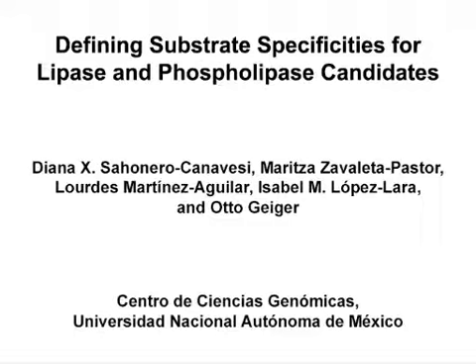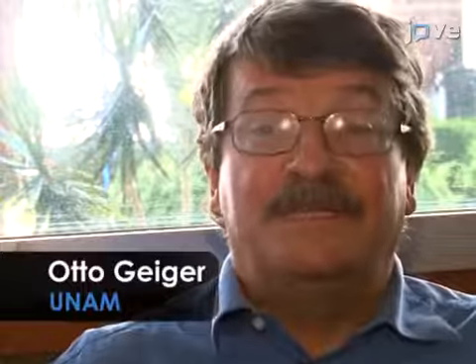The overall goal of this procedure is to accelerate the detection of physiological substrates for potential lipases and phospholipases. This method can help answer key questions in the enzymology field, such as how phospholipases contribute to lipid remodeling in biological membranes. The main advantage of this technique is that the optimization of enzymatic activity and the search for the natural substrate for the enzyme can be performed independently.